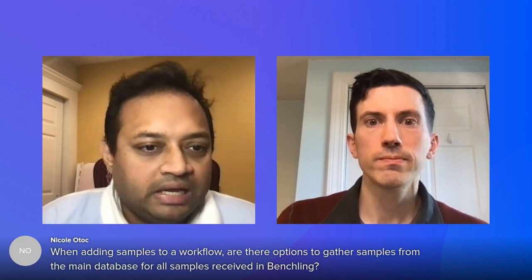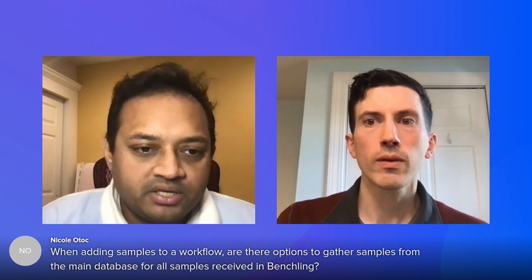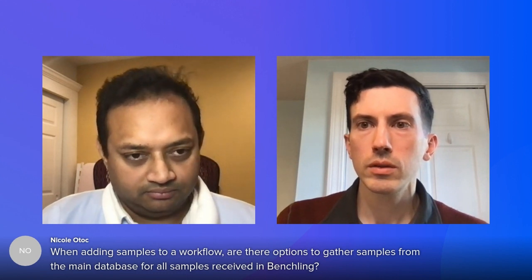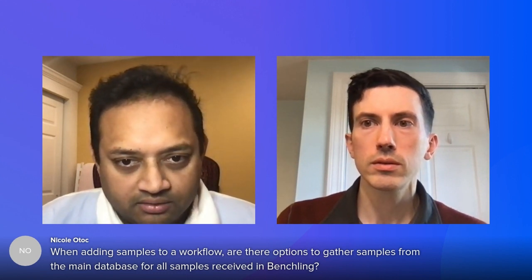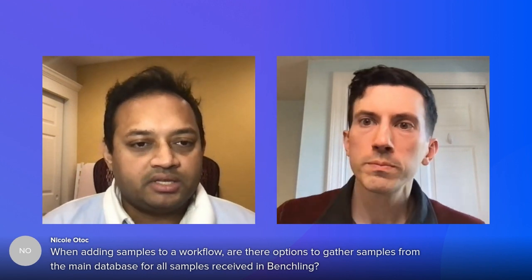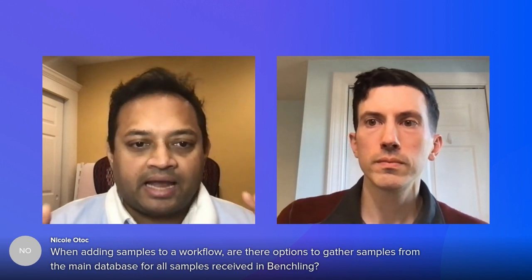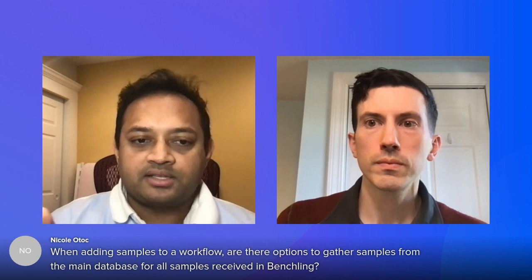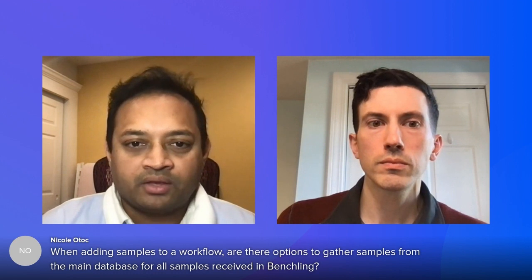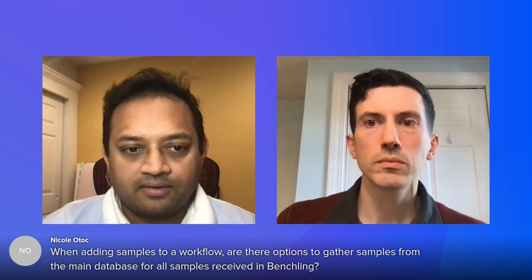Next question we have from Nicole. When adding samples to a workflow, are there options to gather samples from the main database for all samples received in Benchling? Let's see. If I understand this question correctly, it sounds like there's a pool of samples that somebody received, and you want to analyze all of them at once, or maybe a sub portion of those samples. And I think Benchling has what we call work lists. Maybe Tom, you can talk about how work lists can be used to process samples in batches.